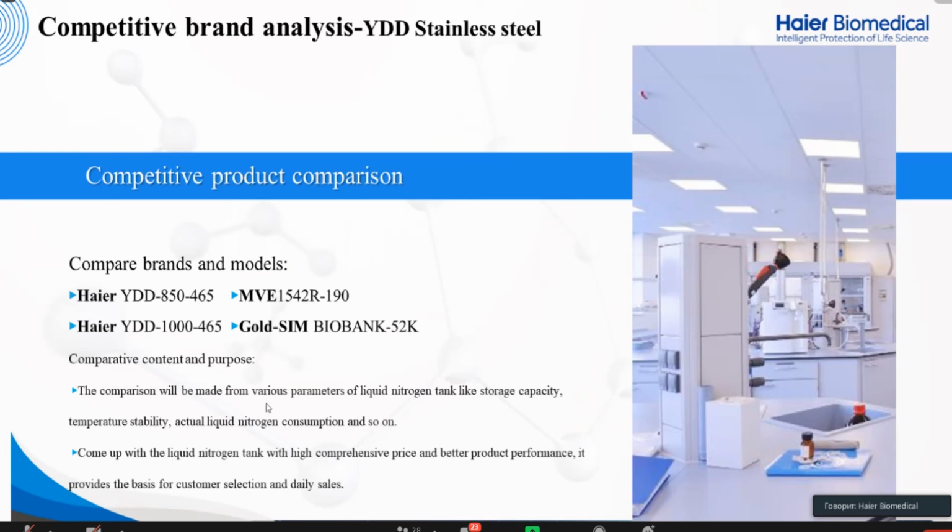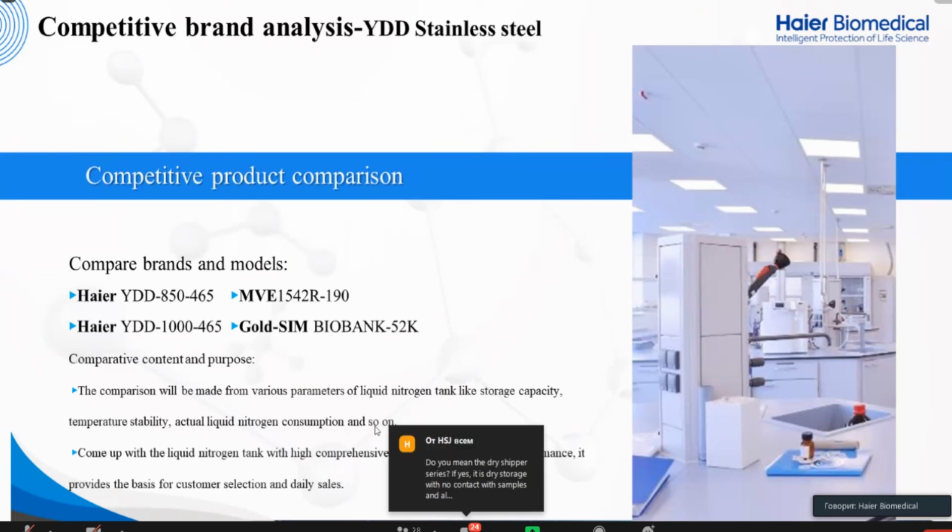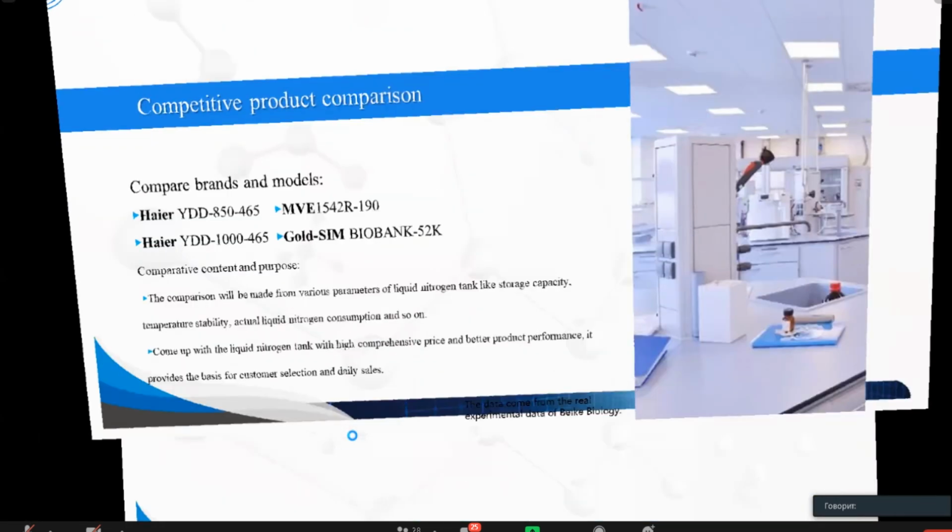The comparison will be made from various parameters: liquid nitrogen tank storage capacity, temperature stability, actual liquid nitrogen consumption, and so on. These kinds of terms compare their ability, which is better. You can confirm these specifications.